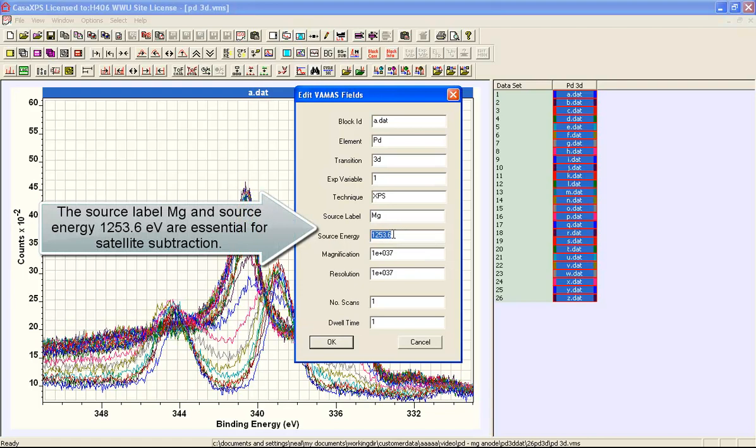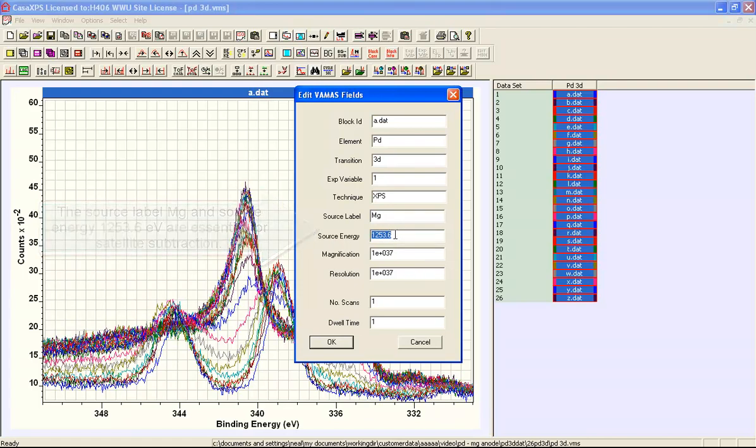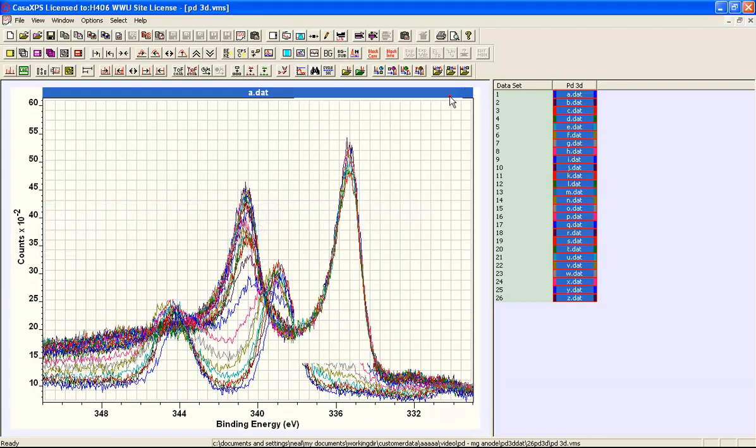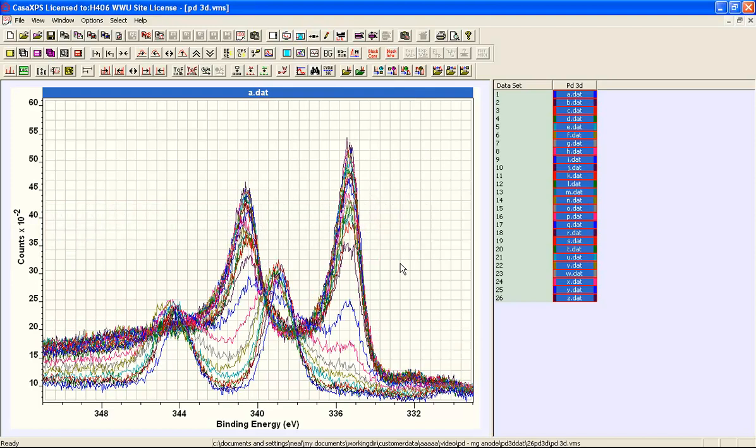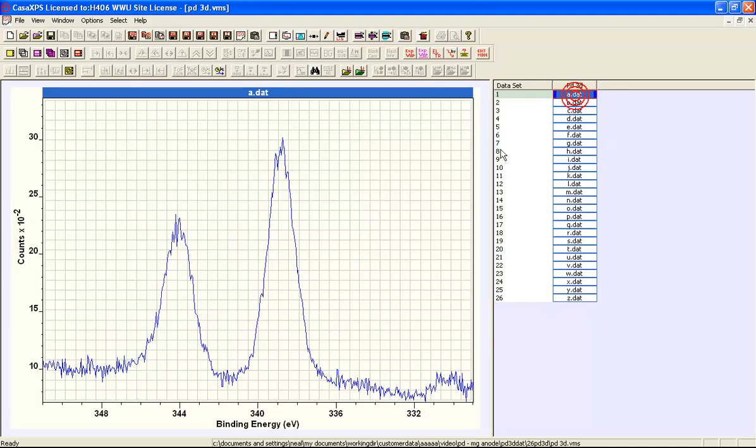And the photon energy for the primary resonance peak from the magnesium anode. However, there are other X-ray peaks of lesser importance but nevertheless they are part of the spectrum that comes off the magnesium anode.